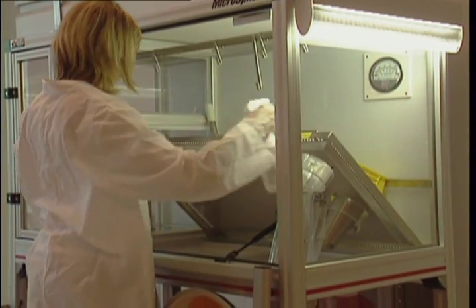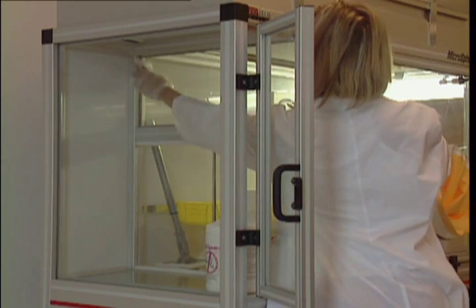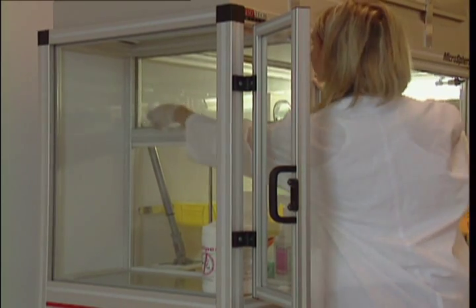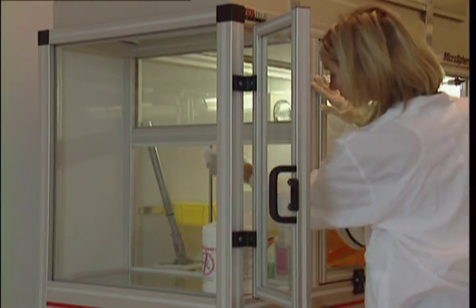Clean the work chamber and anti-chamber work surfaces. Clean both sides of the anti-chamber transfer door. Clean the clear and wide vertical panels of the anti-chamber and the work chamber.